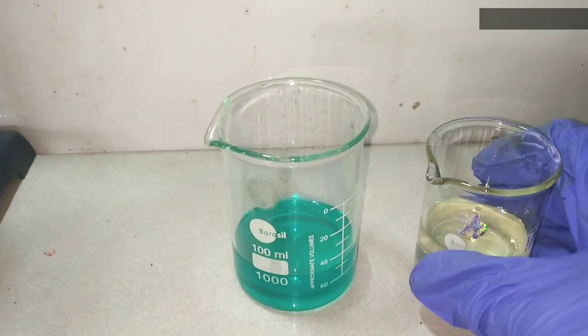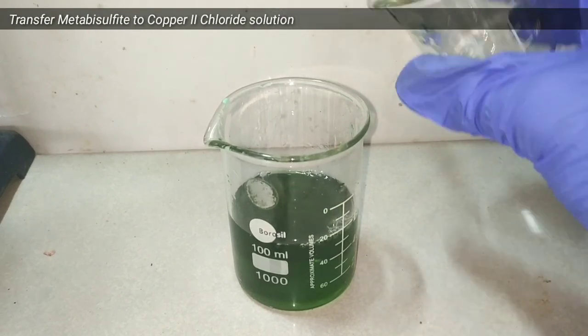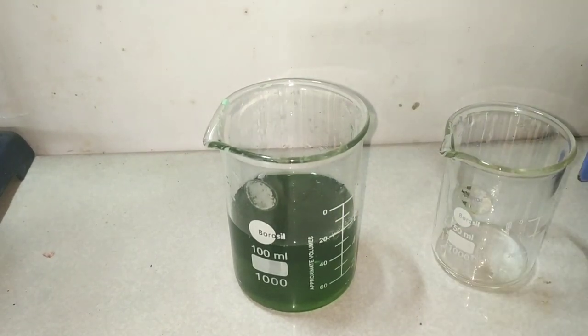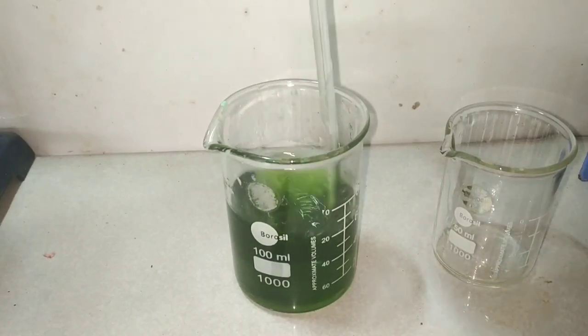I have already made a solution of the copper 2 chloride. Now we pour the metabisulfite solution into the copper 2 chloride. Immediately, you observe a color change — the solution turns darker.